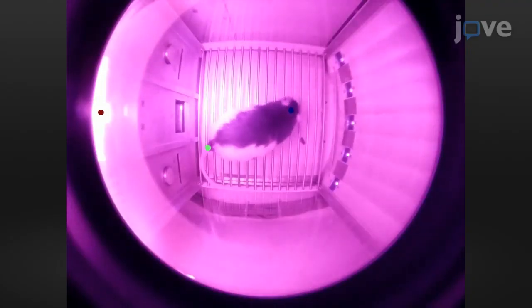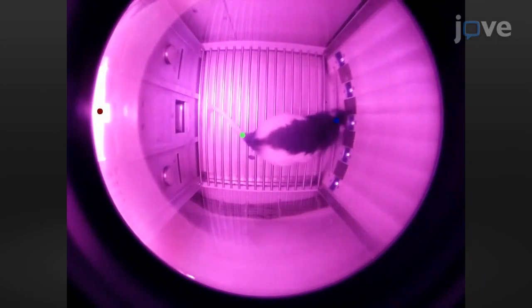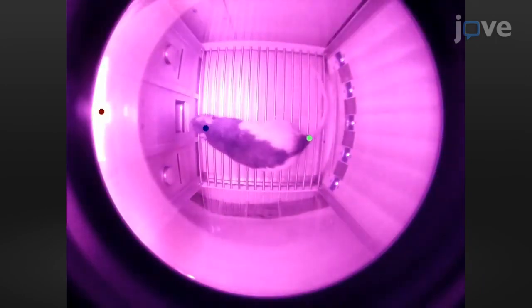This is an attractive approach for labs on a budget. The method is valuable for research projects that involve operant conditioning in rodents, as video analysis can greatly improve the understanding of behaviors seen in this type of test.